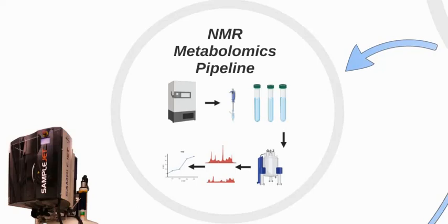Samples are then placed in the NMR spectrometer, analysed, and NMR spectra is acquired. Spectra then undergoes quality control procedures such as alignment and water suppression, and are annotated with known metabolites and analysed computationally. But how does a spectrometer even obtain such information?